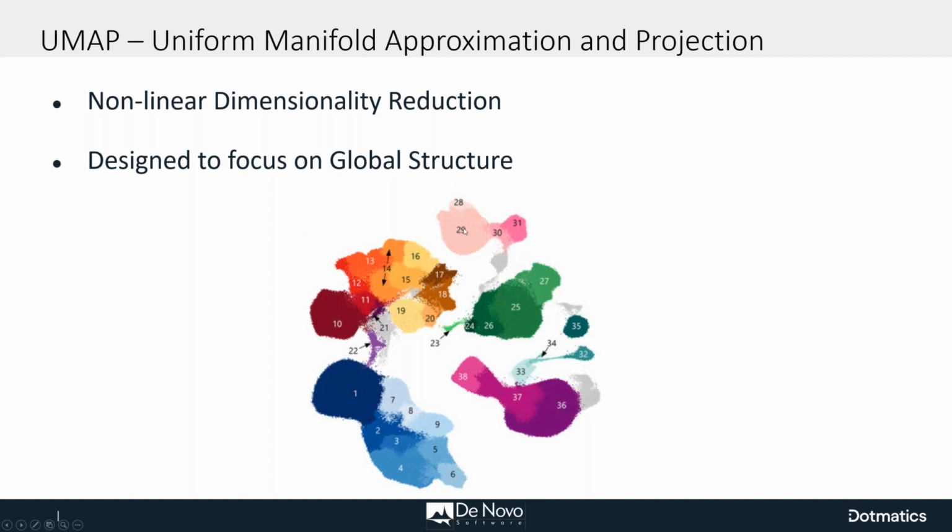just if you have two events in the same island, that means they're essentially the same or very similar cell type. If they're in different islands, that means they're a different cell type. But just because two islands are closer to each other or further away from each other, that doesn't mean that they're more evolutionarily related or separate or anything. It just needs to have some space to put these.